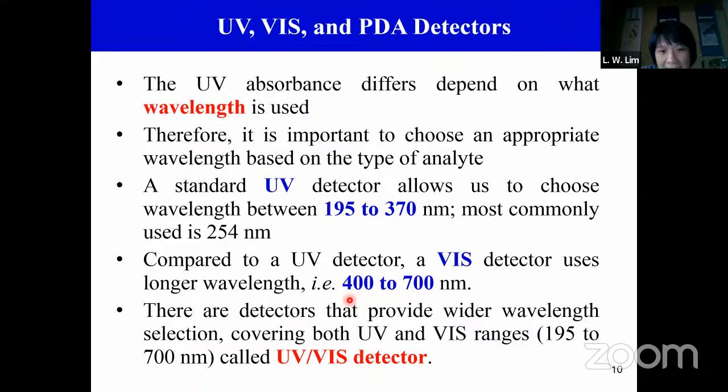So now I have the most common topic, which is cutoff UV. I have a question from City. Cutoff UV is something that we use to increase the sensitivity of the UV detection.